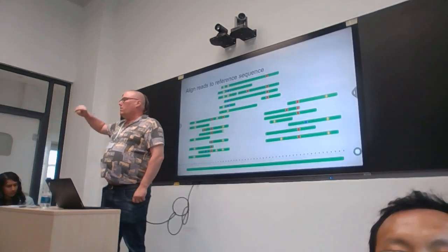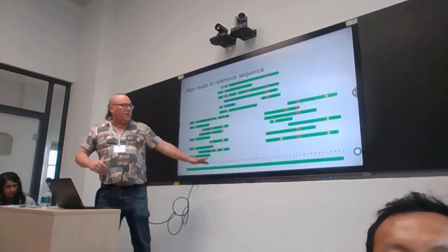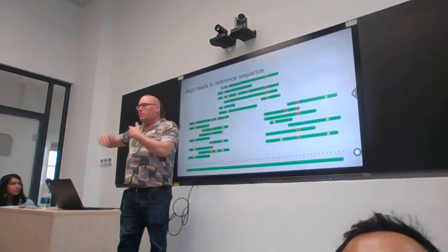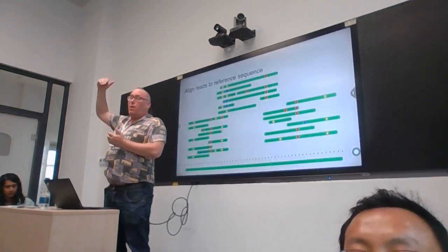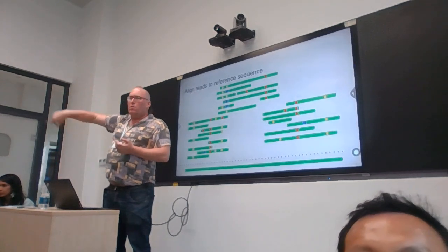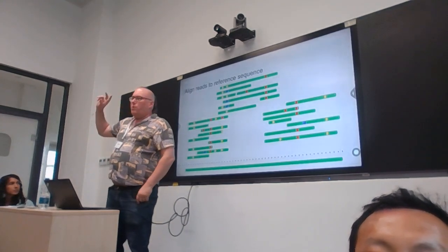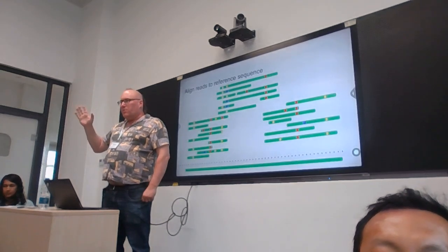And we remove the sequencing adapters. That's all gone. And then we map to reference. And here we obviously have to choose the correct reference, clade 1 or clade 2 reference, okay? And this might evolve because some people are using a B.1 reference from the global clade 2 outbreak that is even different from the main clade 2 reference, okay? But for now, we've got a single reference. We basically have one reference that people seem to be using at the moment for clade 1.